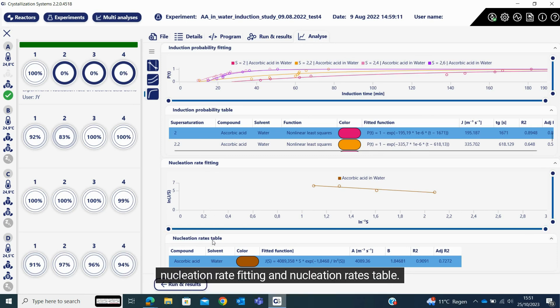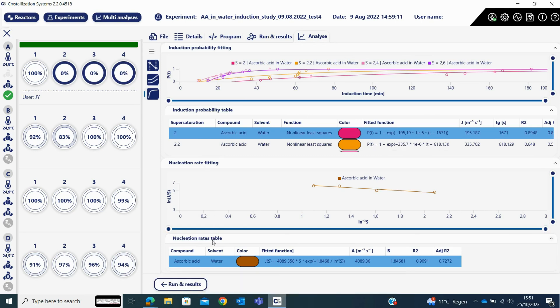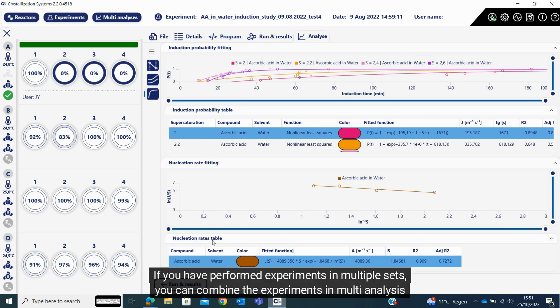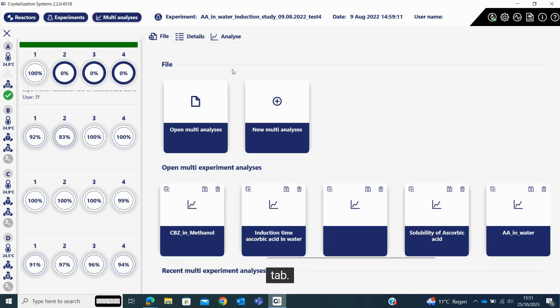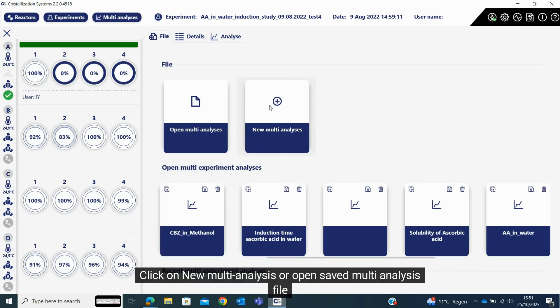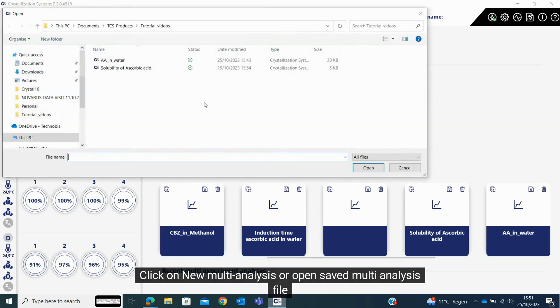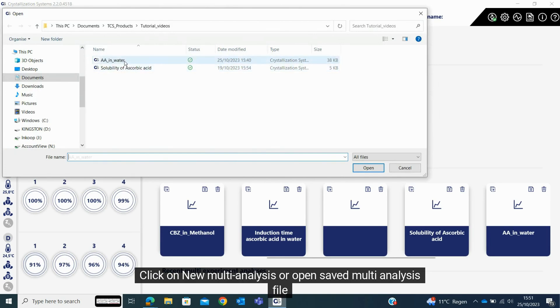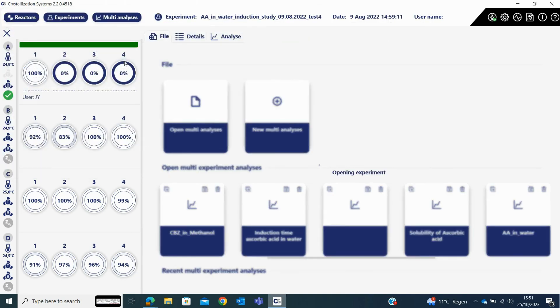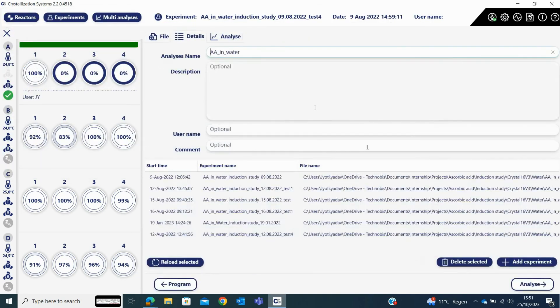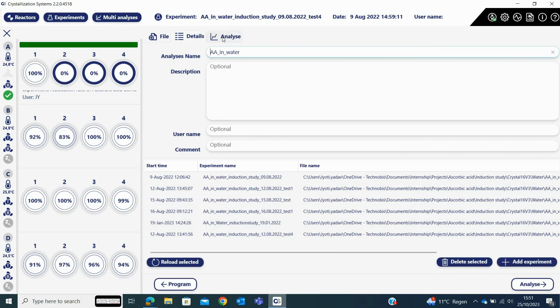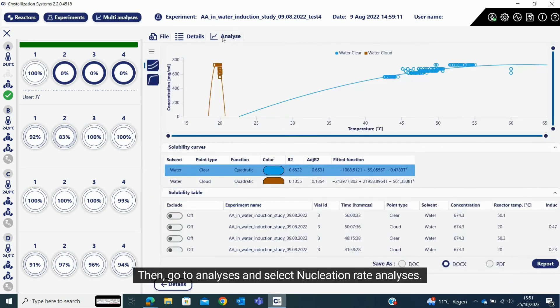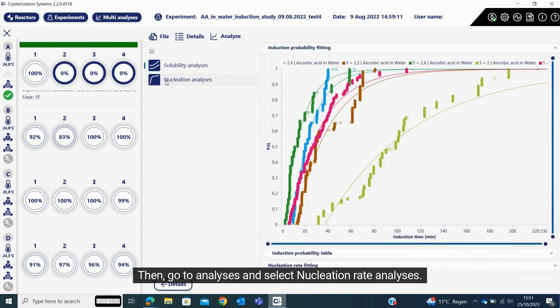If you have performed experiments in multiple sets, you can combine the experiments in multi-analysis tab. Click on new multi-analysis or open saved multi-analysis file. Load the experiment files by clicking on add experiments, then go to analyzes and select nucleation rate analyses.